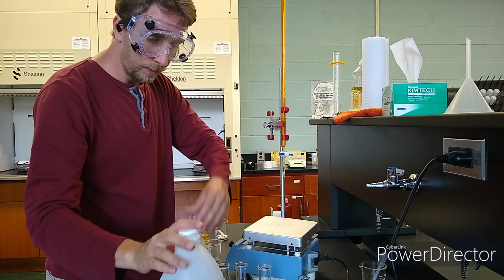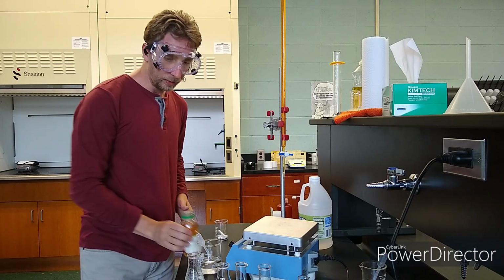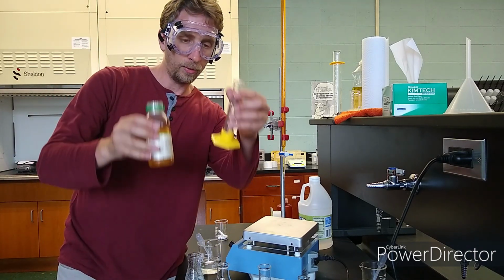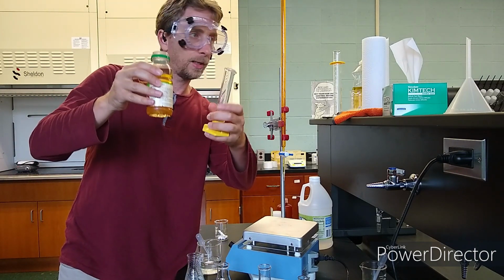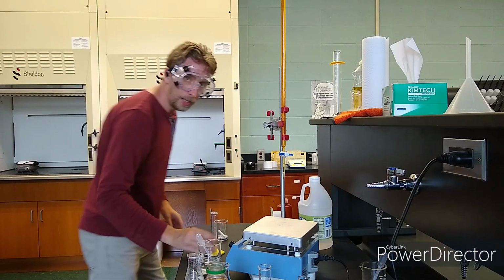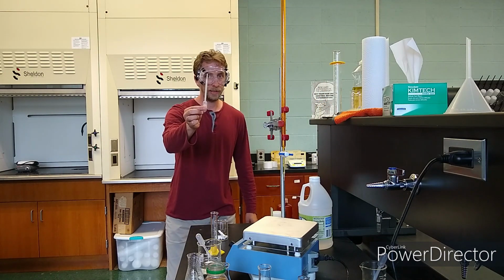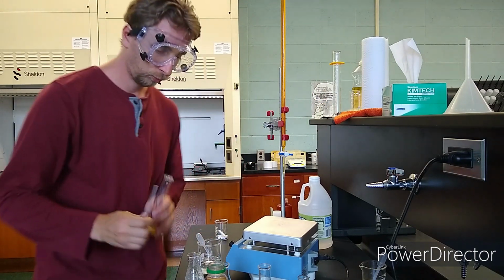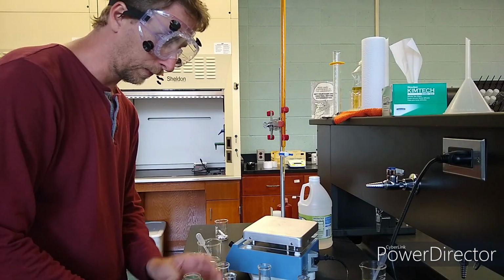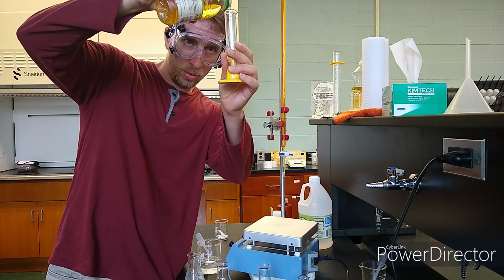And now we need to measure the juice, 20 milliliters of juice into each flask. Now I'm going to try to be a little bit more precise on this one. Maybe I should even break out a plastic pipette. All right. So 20 milliliters of juice.